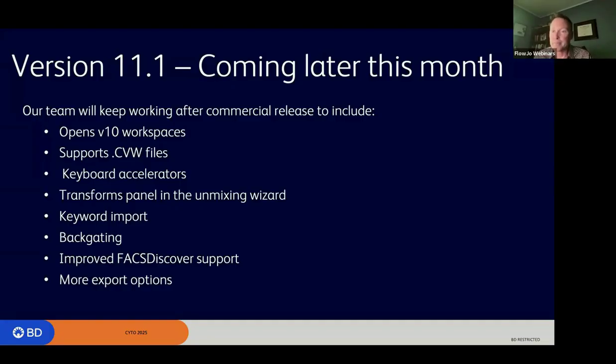So, I try to not use keyboard accelerators too much while I'm demoing, but I love a good keyboard accelerator to speed up my work so I don't have to move around and drag things, etc.